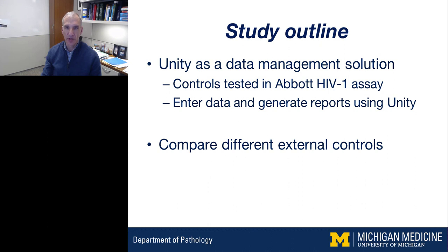So the actual meat of the discussion for today is really a couple of parts of a study that we performed in our laboratory, started last fall. The first part was really looking at Unity as a data management solution, and had controls from a variety of different manufacturers that were tested in our HIV viral load assay using the Abbott M2000. I generated a bunch of data testing those controls and entered that data into Unity and tracked it to see how streamlined that process was, how user-friendly it was.